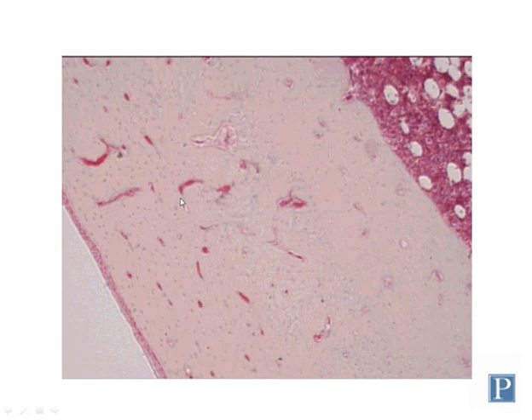However, you can also see there are larger openings or canals. Some of these are relatively circular, some of them are longitudinal to the long axis, perpendicular to the long axis of the bone, or at an oblique angle. And these contain blood vessels and nervous tissue and connective tissue that help to carry blood or allow signaling to occur between cells of the living bony tissue.